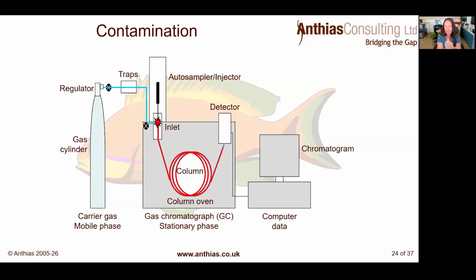We're just heating our inlet, and that can be used to check your inlet and your column and your detector. Now, if you've got extra peaks in your sample, then you'd go to your solvent blank, so through your autosampler. But you can then start to think again, depending on the setup and the method that you have, you can start to isolate individual components.